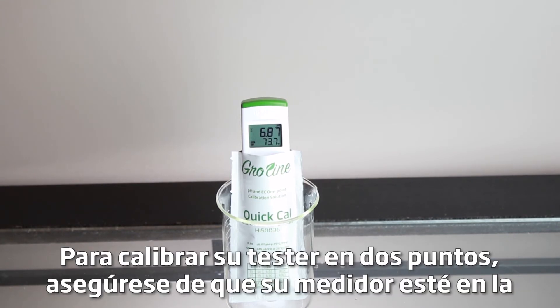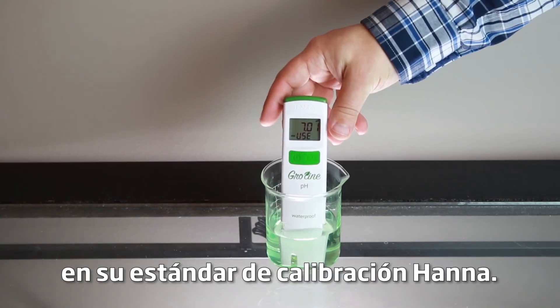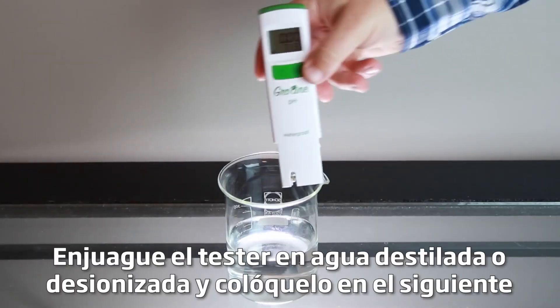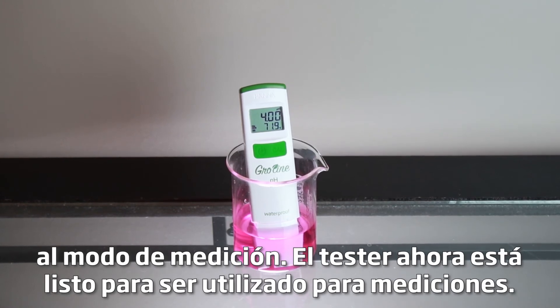To calibrate your tester to two points, make sure your meter is in the Cal Standard setting and place your tester in your Hanna Calibration Buffer. The tester automatically recognizes which buffer you use first. Once recognized, it will ask you for the next buffer. Rinse the tester in distilled or deionized water and place it in the next buffer. After it's complete, the meter will automatically return to measurement mode. The tester is now ready to be used for measurements.